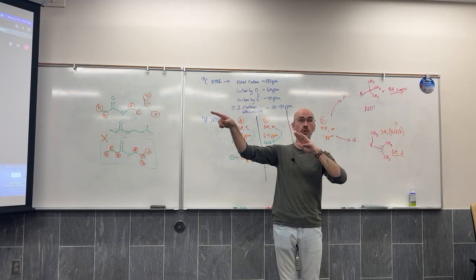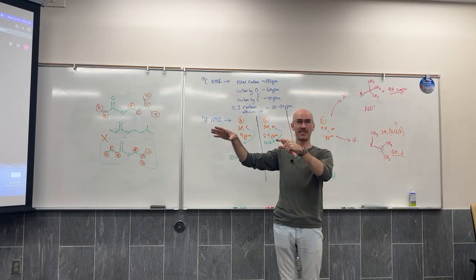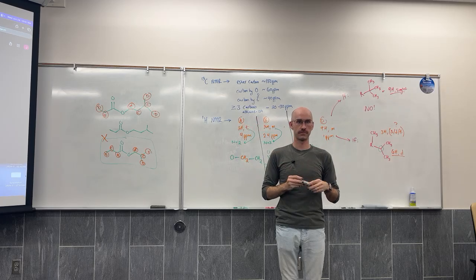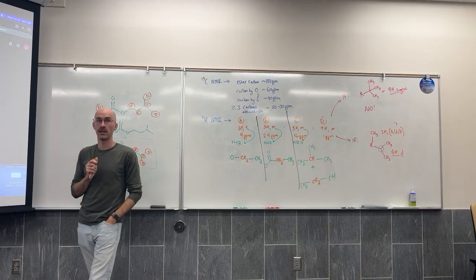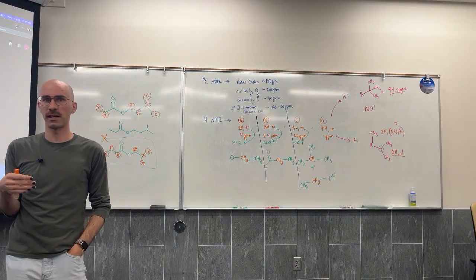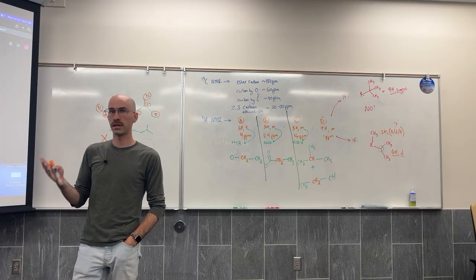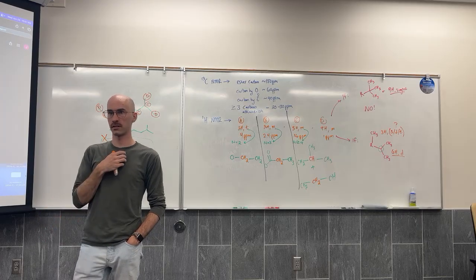You were given it. And then, I decided it because I picked the spectrum from online and then I manually added in those numbers. What does that do for us, helping us identify the chemical? It tells you how many hydrogens produce that signal, which means if you take the integration from an NMR, you know how many hydrogens are in the molecule. Because all of the hydrogens in the molecule produce a proton NMR signal.